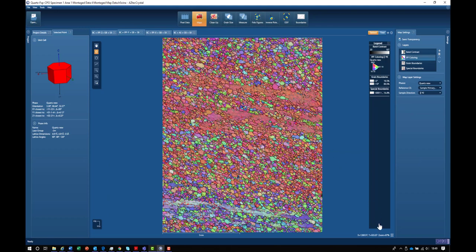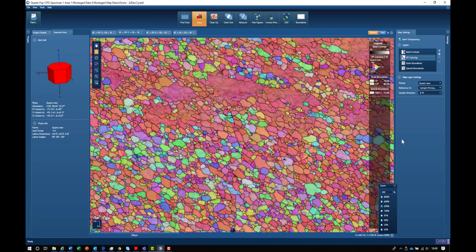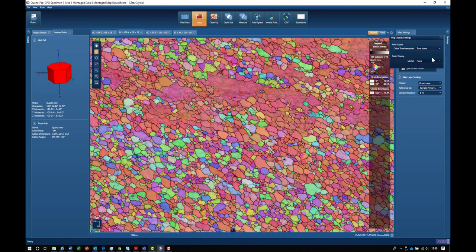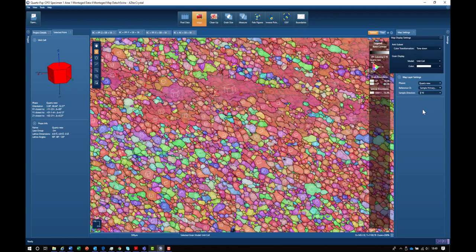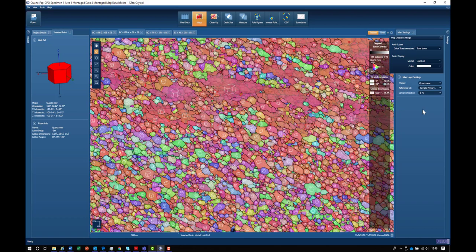There's one final thing we can show in Aztec Crystal. If I go to a higher zoom and switch on a grain display, we will put the unit cell orientations of every grain superimposed onto the map itself.